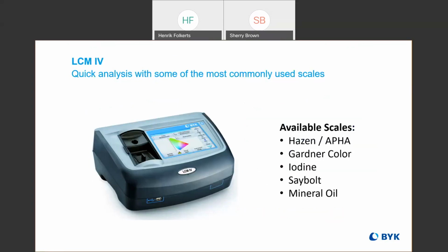So for the LCM4, the available scales are Hazen or APHA, which are essentially the same scale. It goes from 0 to 1,000. It's essentially a yellowness scale. It can evaluate Gardner color numbers. And one of the benefits of using an instrumental device like this rather than the visual method is you can get better precision, better resolution with this.